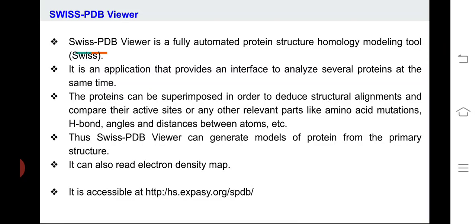The proteins can be superimposed in order to deduce the structural alignment and compare the active sites and relevant parts like amino acid mutations, hydrogen bonds, angles, distance between atoms, etc. This Swiss PDB viewer can generate models of proteins from the primary structure.